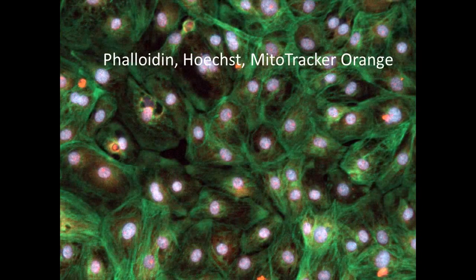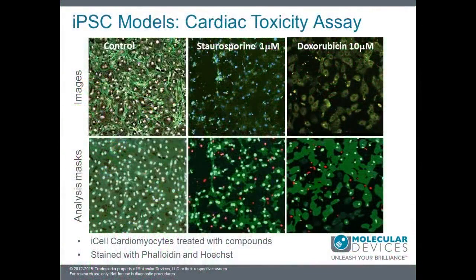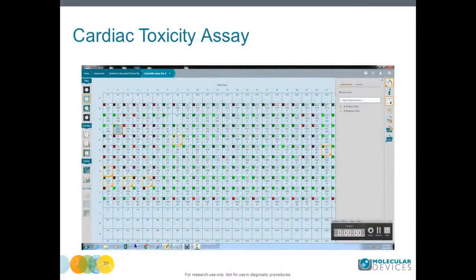Cell staining includes the combination of several dyes, as we described before. Here you can see the images of control cardiomyocytes and cells treated with staurosporine or doxorubicin. We tested the panel of known cardiotoxic compounds, and to evaluate cardiac toxicity, cells were treated for 24 hours. Readouts include nuclei count and intensity, also cell area and stain intensity, and also the numbers and percentage of positive or negative cells. For cardiotoxicity assay, live cell analysis or cell scoring analysis was used.